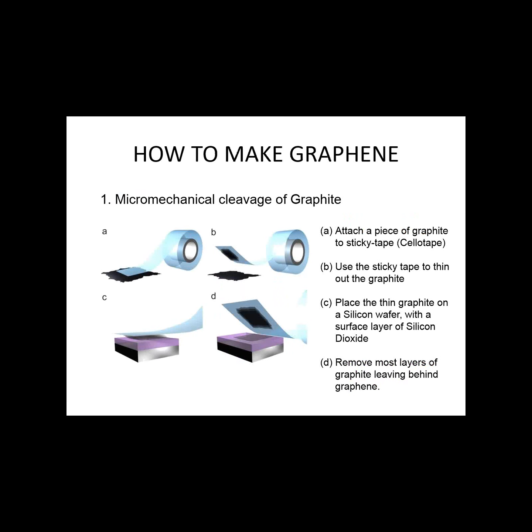And how we make graphene, for example, the samples that Greg will be talking about today, they were made using what we call the micromechanical cleavage method, or more colloquially the Scotch tape or sellotape method. As the cartoon shows, you put down a piece of sellotape on a piece of graphite, peel off a few layers on the sellotape and then transfer those layers down onto your choice of substrate. It can be silicon dioxide, it can be silicon nitride, it can be boron nitride. There are a variety of different substrates on which you can put graphene.